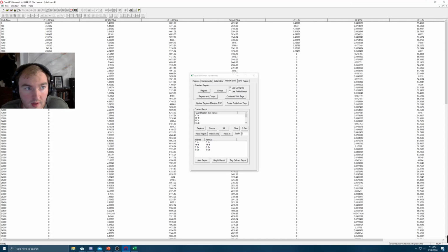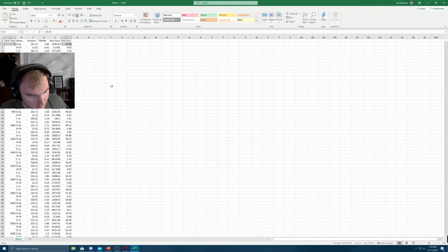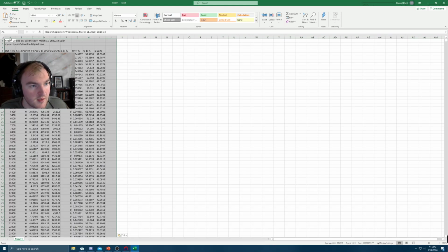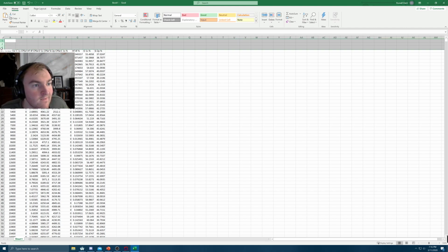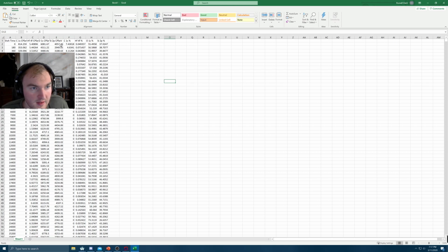So now if we copy this guy, copy all. This also has that information at the top. And if we Control A, take that, Control paste, do the same thing we did before. Now we have etch time and our atomic percents right there for us, and the counts per second is like the integration value.